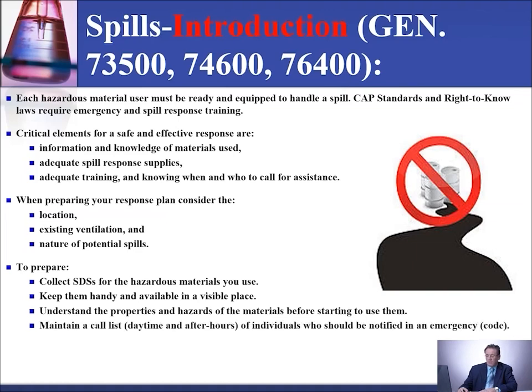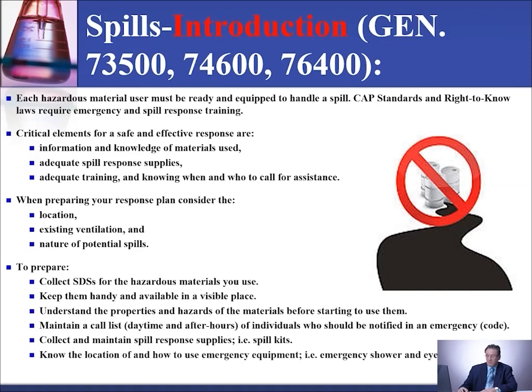Maintain a call list, daytime and after hours, of individuals who could or should be notified in case of an emergency or a code. Collect and maintain spill response supplies like spill kits. Know the location and how to use emergency equipment like the emergency shower and the eye wash. Train and practice for effective spill responses.